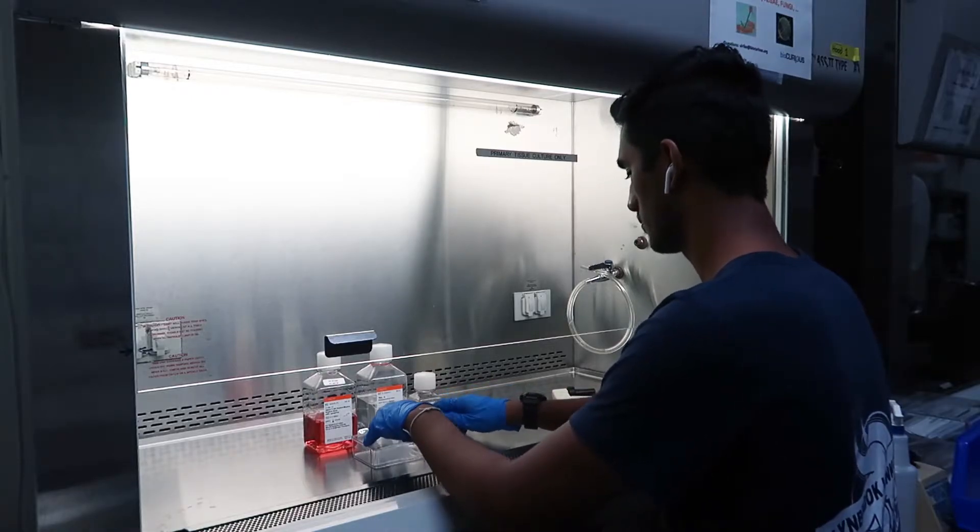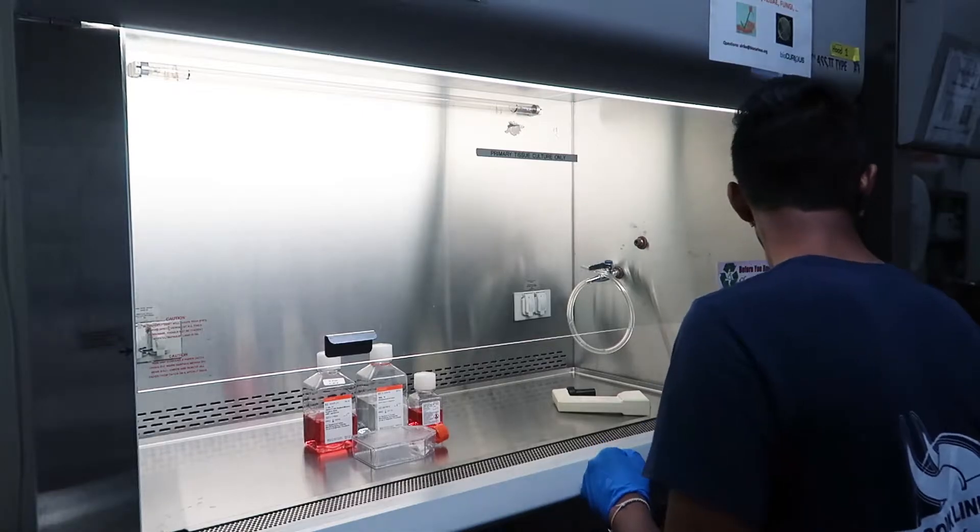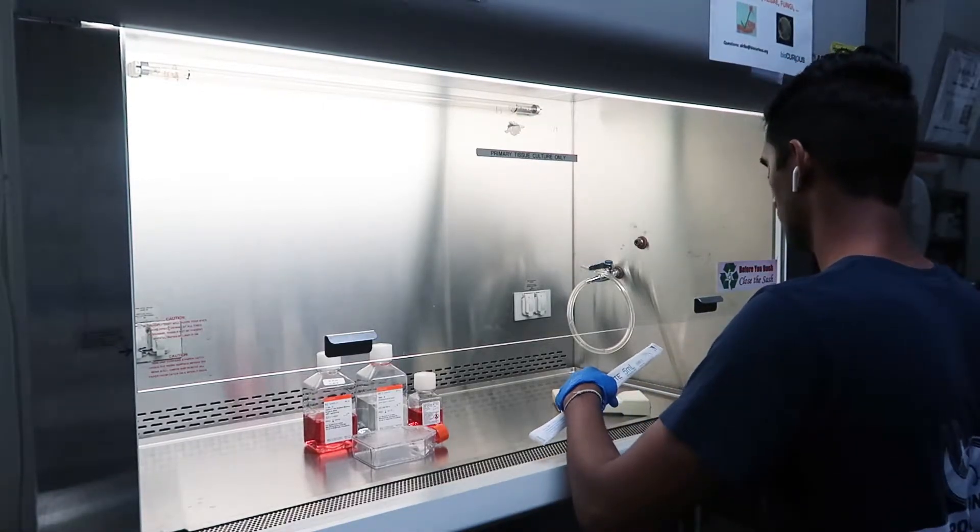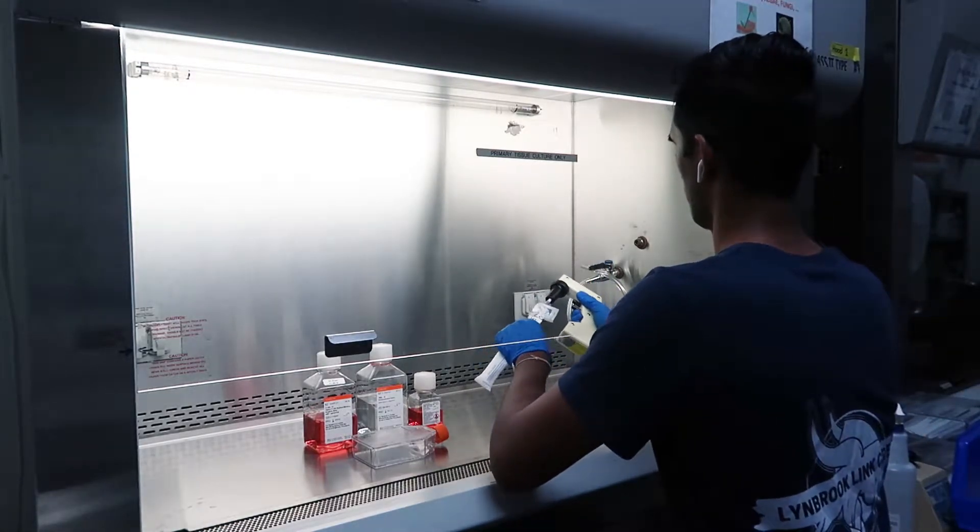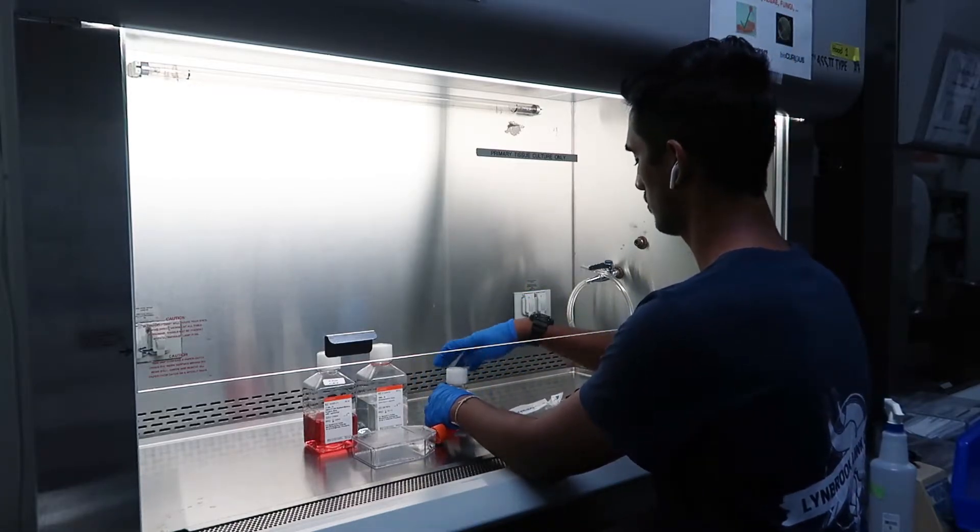The next step is to disassociate these cells from the bottom of your flask and this is going to be done using trypsin EDTA. So in this step, we're going to be using once again, a serological pipette and a serological pipette pump to add three milliliters of trypsin EDTA to the cells directly.